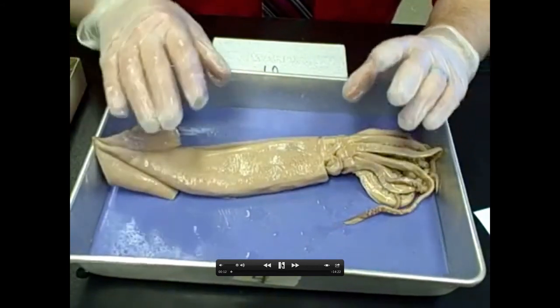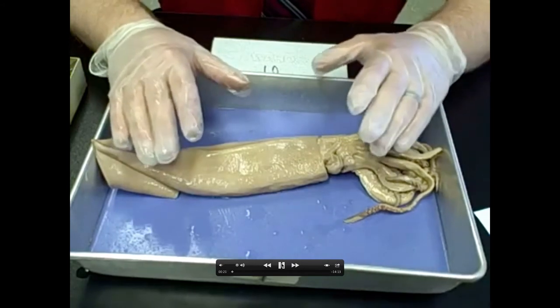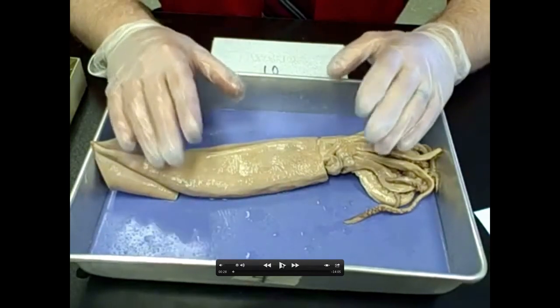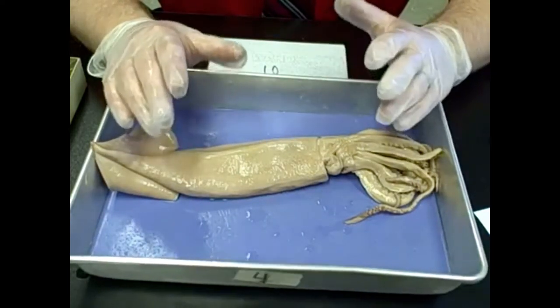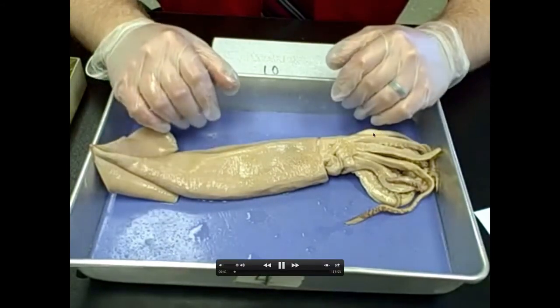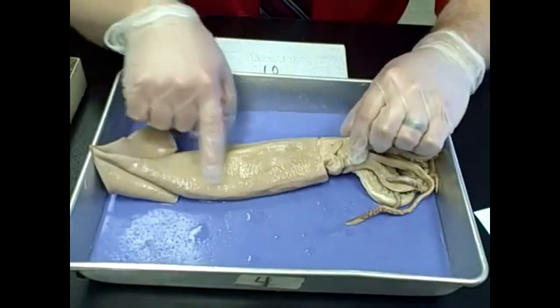So here you have the squid like we looked at. Quiet. What it has, it is in a squid dissection pan. And you don't hear anything because there is no sound. On the squid, basically the gentleman, I have another video that actually is showing me dissecting, but I want to be able to show this on the video for the class, so I'm going to show this video.